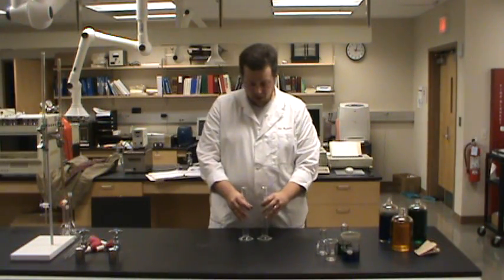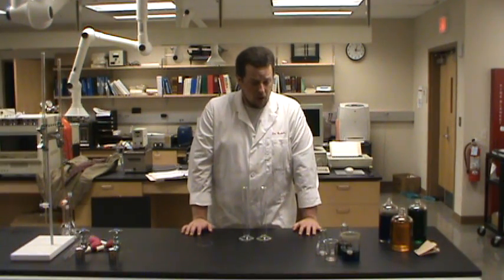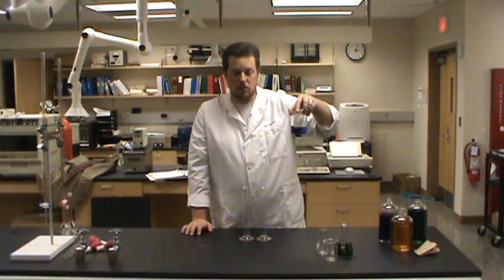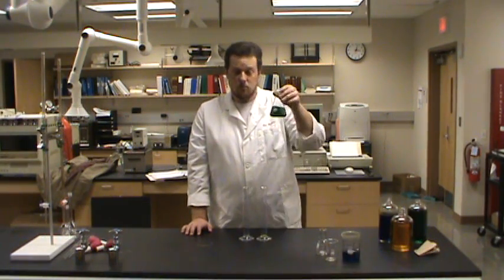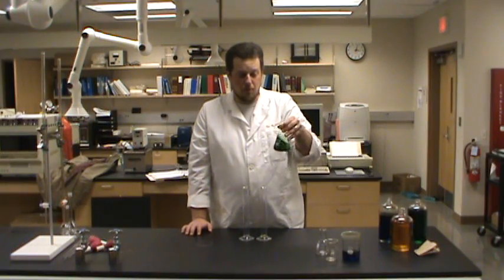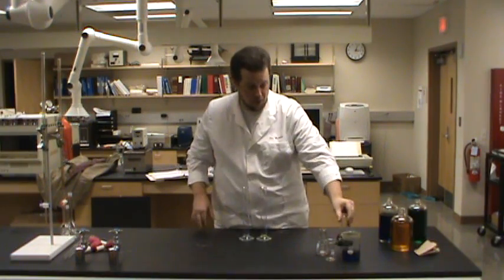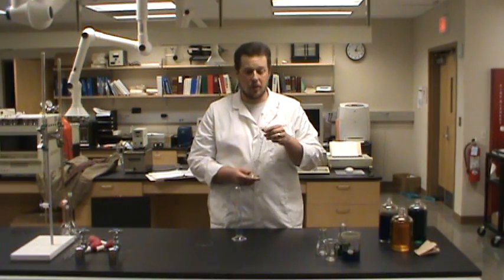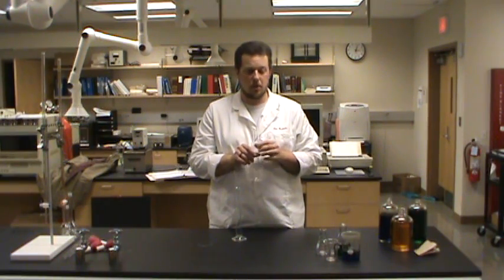So those are graduated cylinders, and that's really the majority of the glassware that you'll find in your lab drawers. So your lab drawer glassware is good for getting approximate amounts of reagents that you want to transport. And if you want to swirl or cap, you can use an Erlenmeyer flask. Or for measuring volumes of liquids to, in the case of this graduated cylinder, within about 0.6 milliliters.